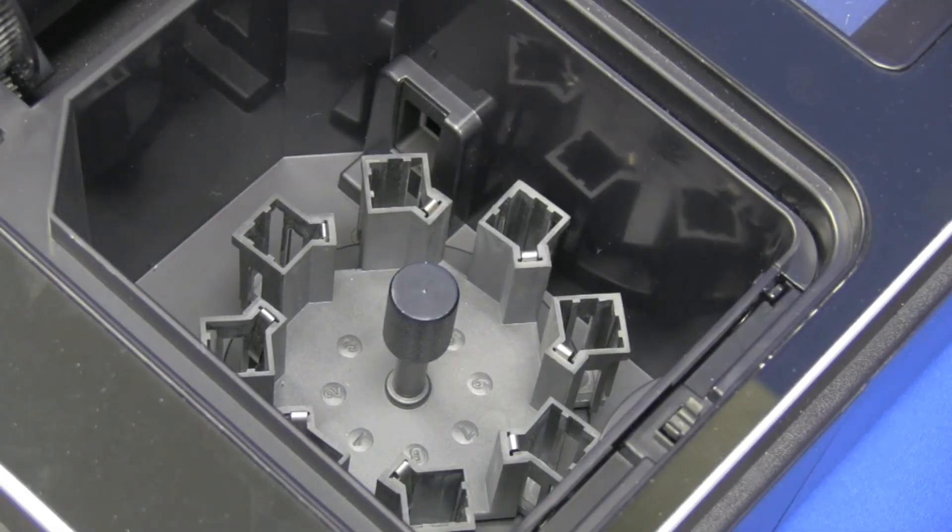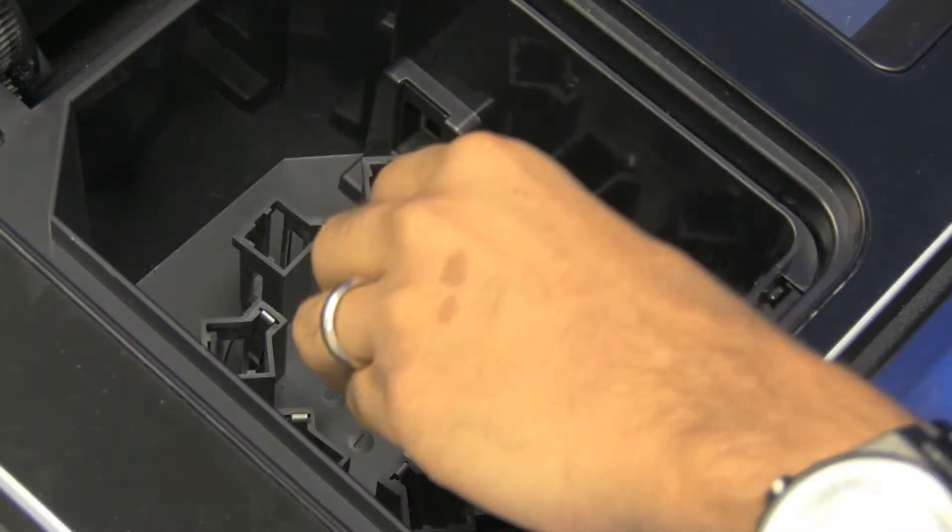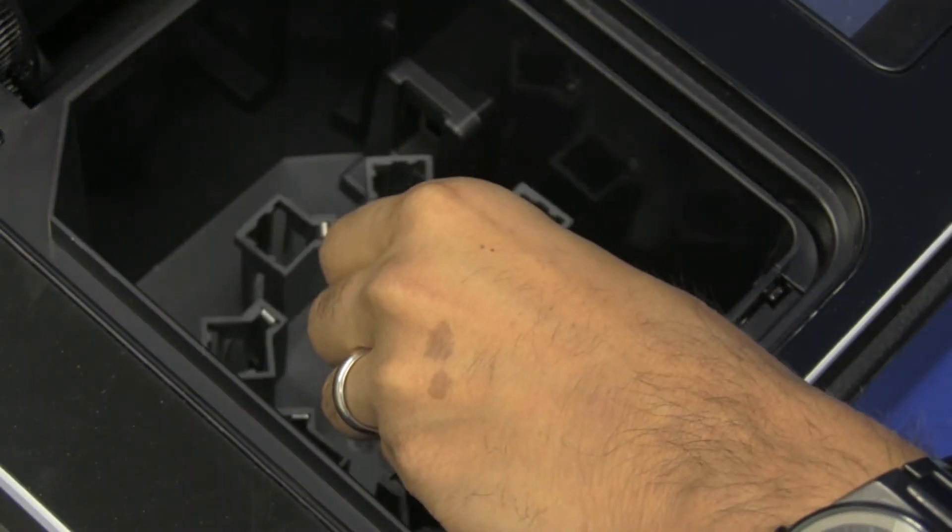So immediately we see that with the Pop, we have the eight-position rotating multi-cell holder. This allows for up to eight samples to be placed into the instrument at any one given time, alleviating the need to restart the system every time you want to reload another sample.